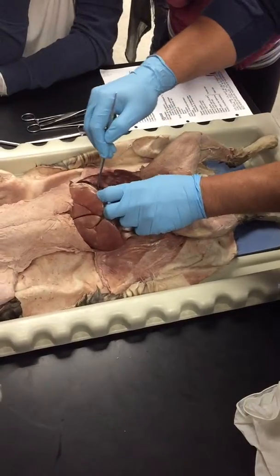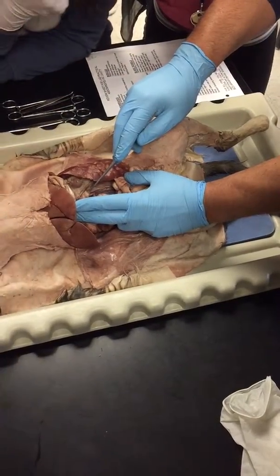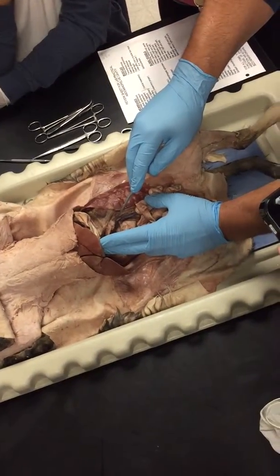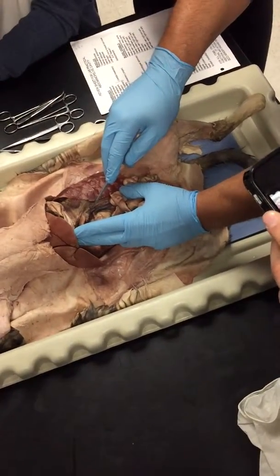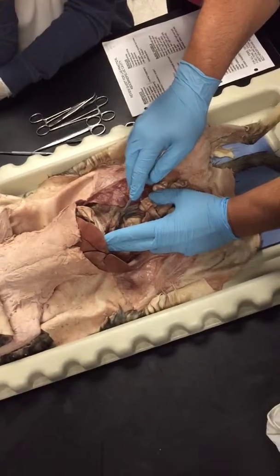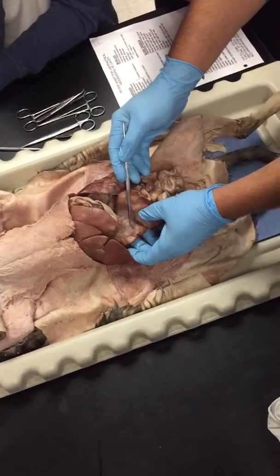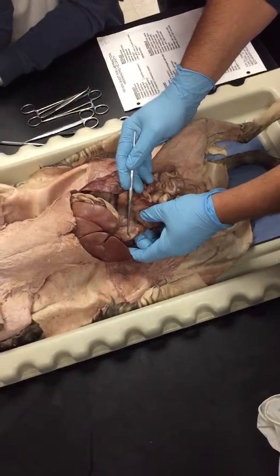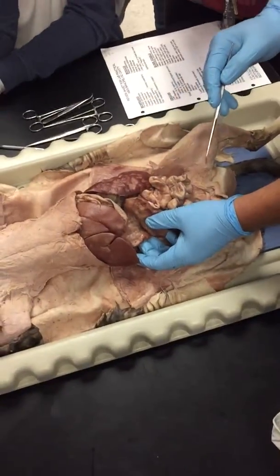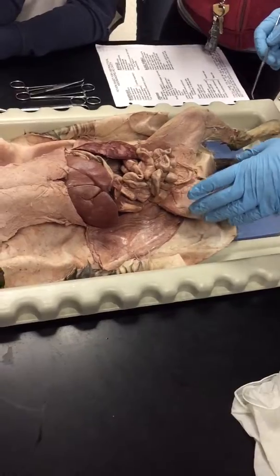All right, let's take a look underneath the stomach to find this organ right here. If I'm going to ask you to be specific, what is this? The transverse lobe of the pancreas. Okay, so you have to identify it as pancreas, and if I'm asking you to be specific, you have to say the transverse lobe of the pancreas, because here's the other lobe right here, located right next to the duodenum, so it would be the duodenal lobe of the pancreas, or ventral lobe. All right, so that's the pancreas.